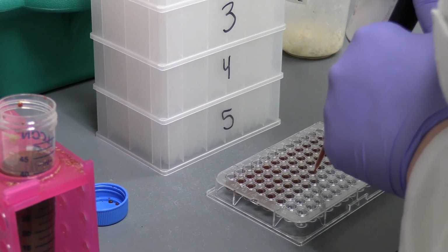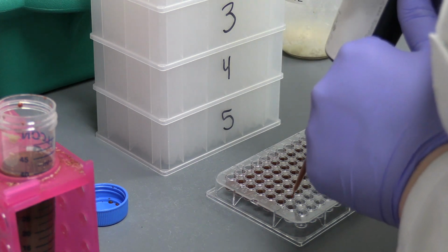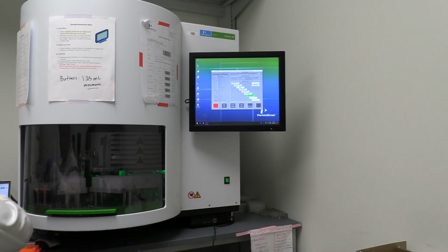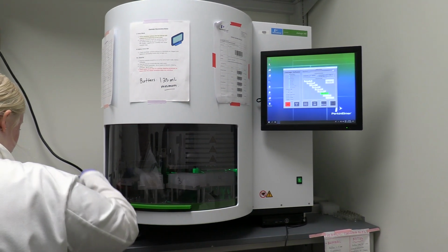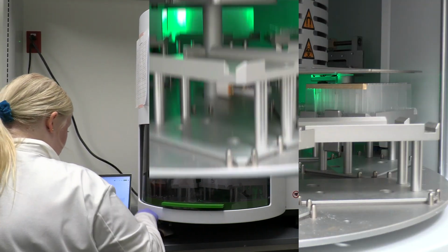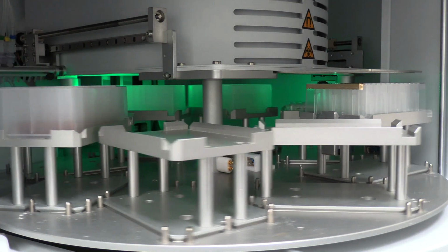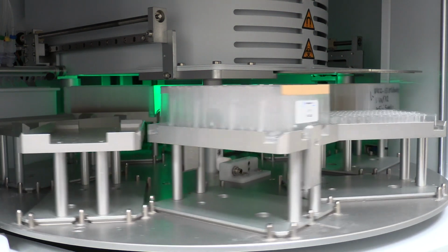Magnetic bead extraction uses small magnetic particles to capture nucleic acid from a lysed sample. An automated nucleic acid purification system is used to carry out extraction. There are several benefits to using an automated purification system, including a decrease in processing time and potential for contamination, and an increase in throughput and reproducibility.